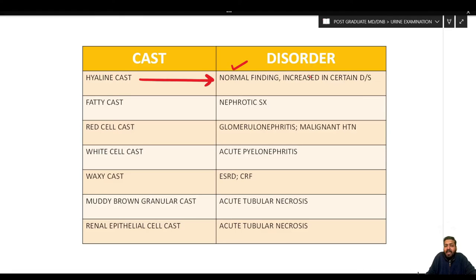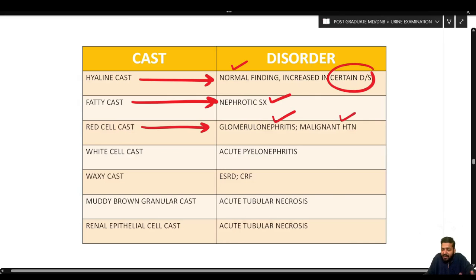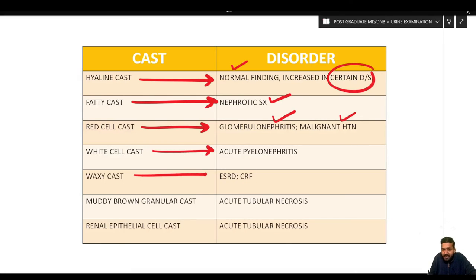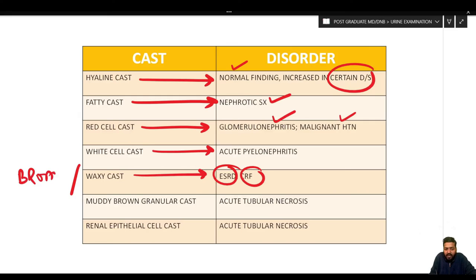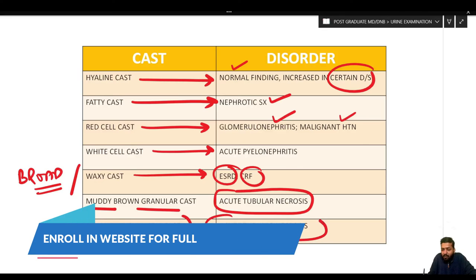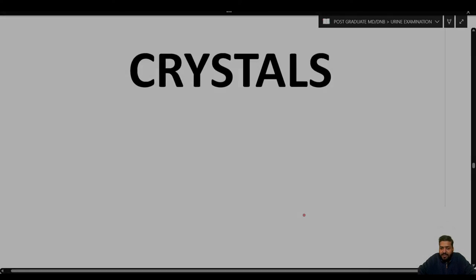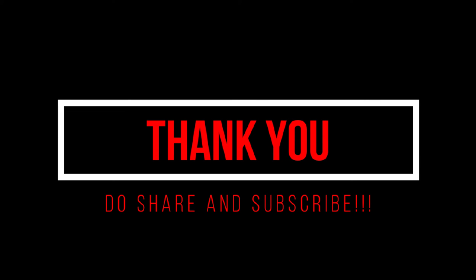To summarize the different casts with associated disorders: occasional hyaline casts are normal; excessive hyaline casts indicate disease. Fatty casts indicate nephrotic syndrome with lipiduria. RBC cast indicates glomerular nephritis or malignant hypertension. WBC cast indicates acute pyelonephritis. Waxy cast and broad cast are seen in end-stage renal/chronic renal failure. Muddy brown granular cast indicates acute tubular necrosis. Renal epithelial cell cast also indicates acute tubular necrosis. Next, we will discuss the different types of crystals.